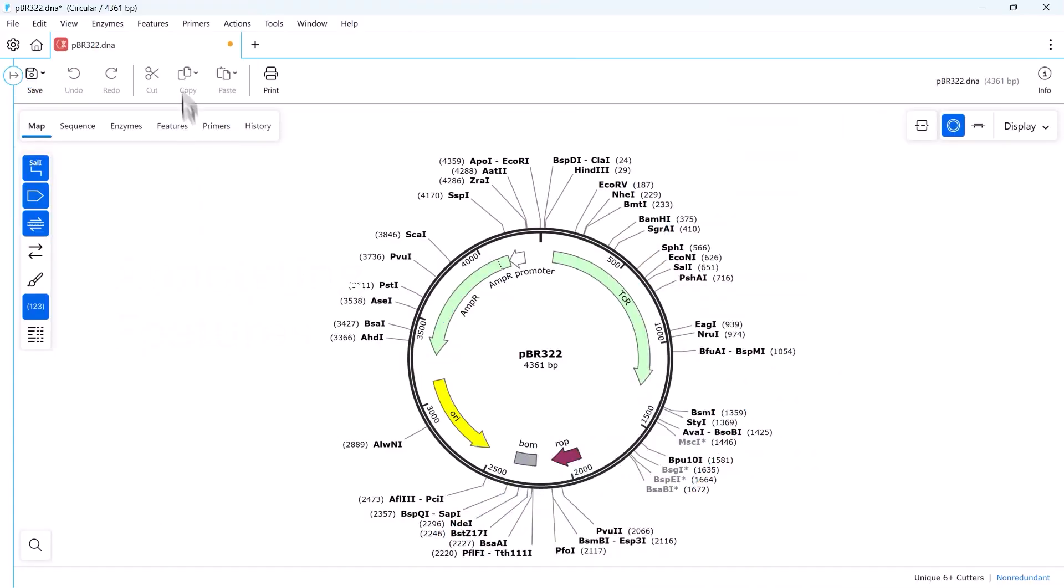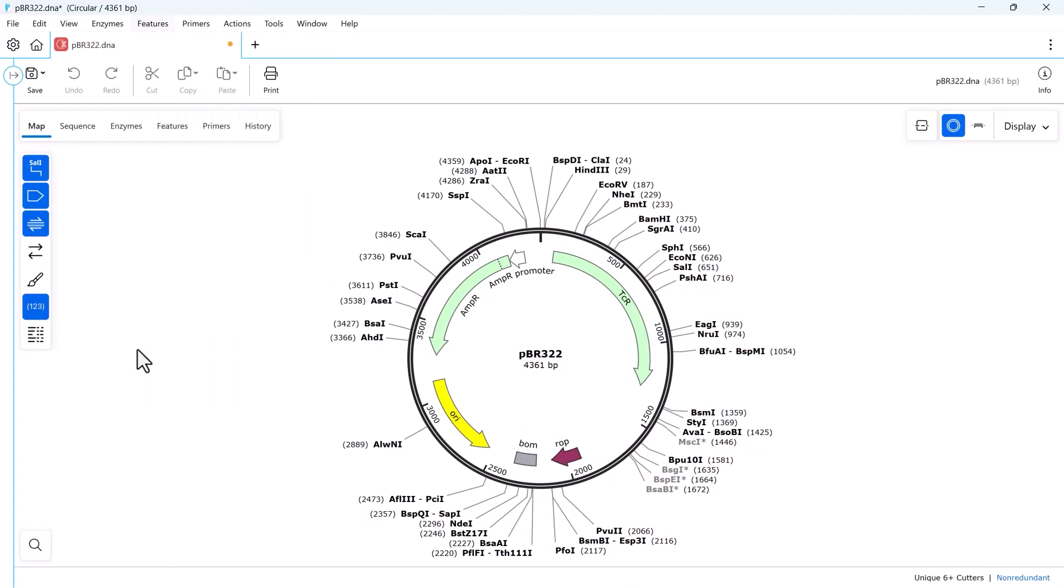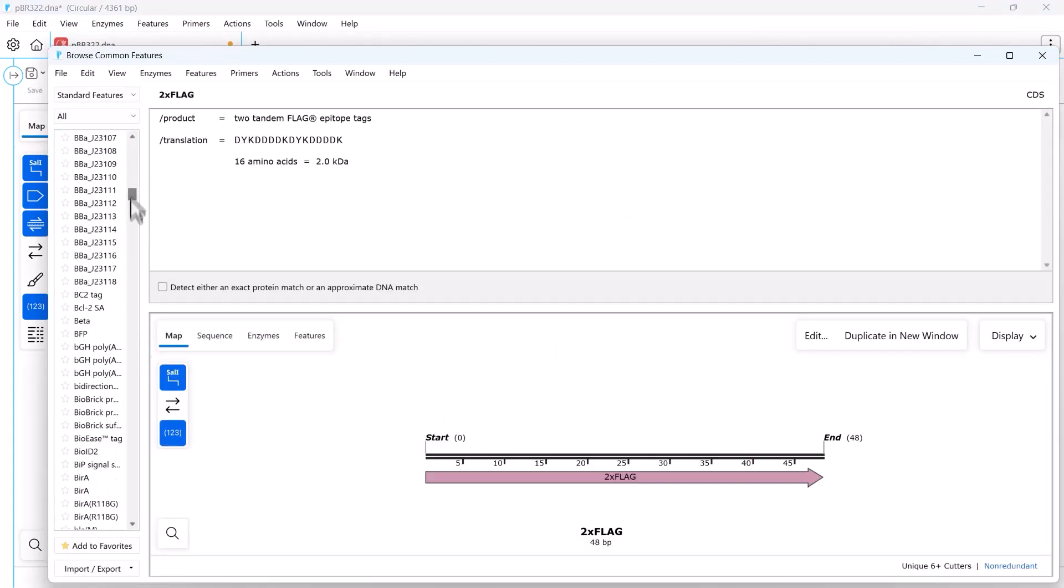SnapGene comes preloaded with hundreds of features found on common cloning vectors and automatically adds relevant features to any new DNA sequence.